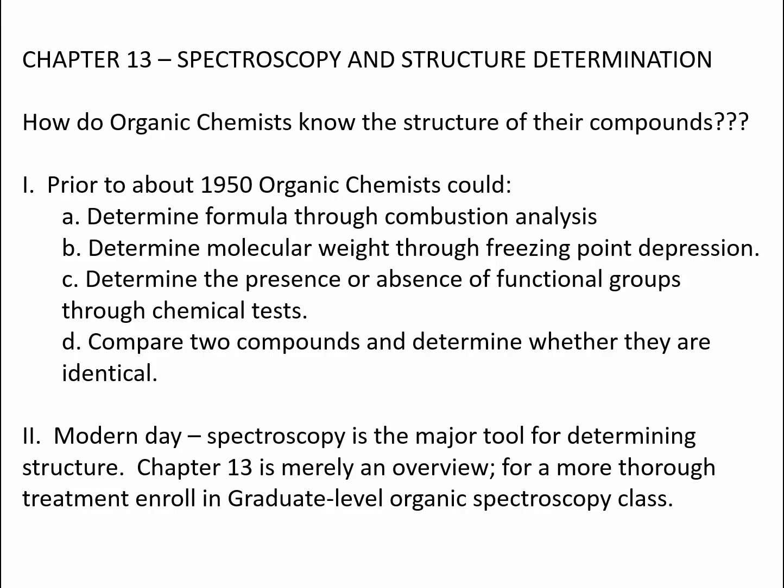Okay, so in the video today, we're going to look at spectroscopy, organic spectroscopy specifically. How do organic chemists know the structure of their compounds? Prior to about 1950, structural assignment was a very difficult thing to do.